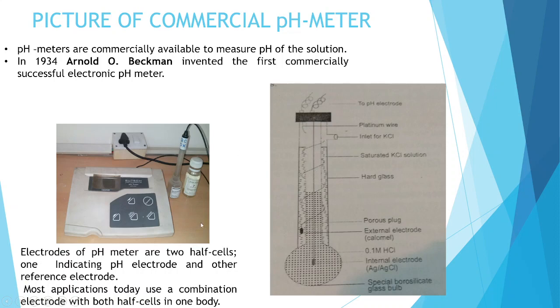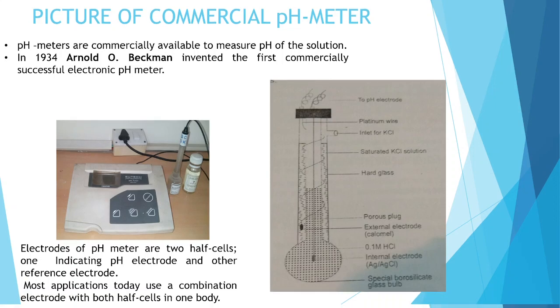Both are contained in one glass casing, and both half cells are present inside this, like this. Details of this we will be seeing in the next slides.